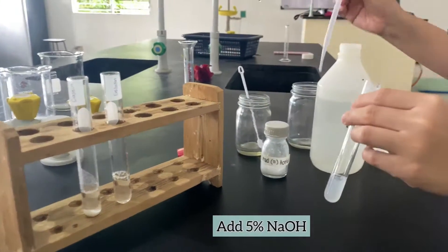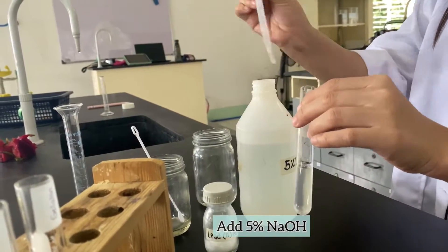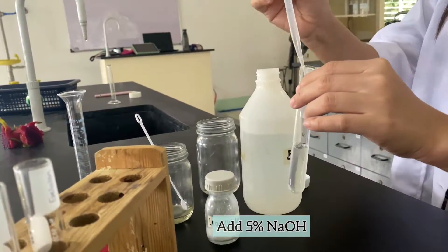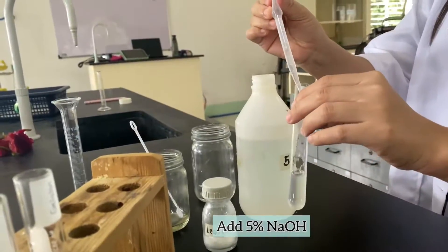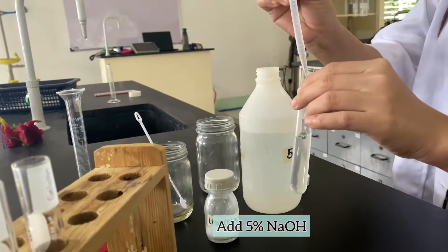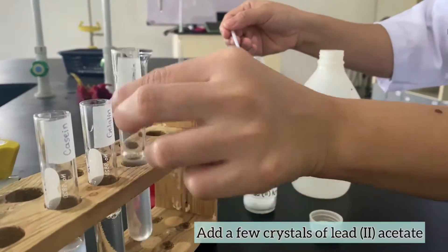For this test, about 5 ml of 5% sodium hydroxide solution was added to each protein suspension. And then a few crystals of lead-2 acetate was also added. It was then heated in boiling water for 5 to 10 minutes with occasional mixing.